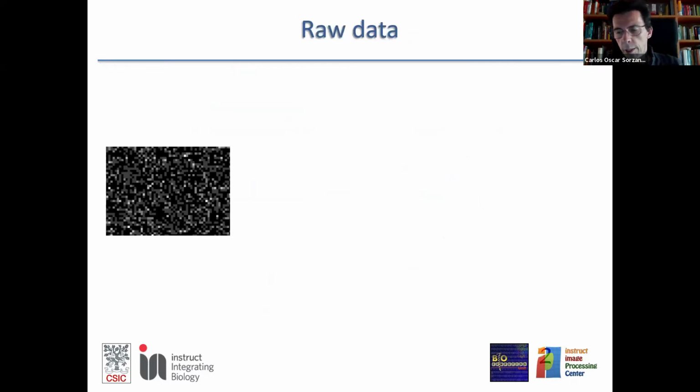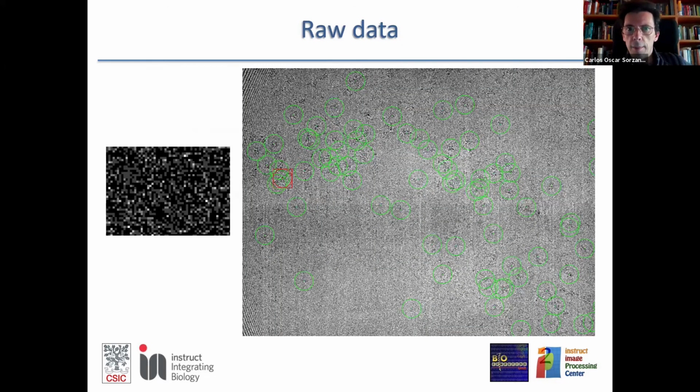And in cryo-EM in general, this is the kind of raw data we collect. They are extremely noisy, very low contrast, and with very complicated mathematics. These are Poisson counts, and only when you start processing the raw data do you get something meaningful out of these acquisitions.